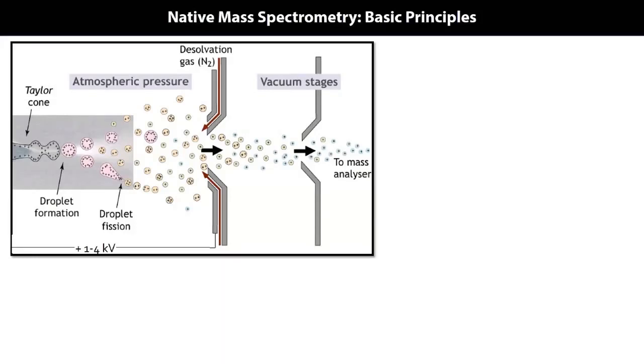So the first concept we have to get around is that of native mass spectrometry, which Albert covered in his keynote yesterday. Just to remind you, the idea here is that we're going to try and develop approaches that directly capture proteins and their complexes from solution using nano-electrospray ionization and carry those as ions into the instrument for direct measurement.